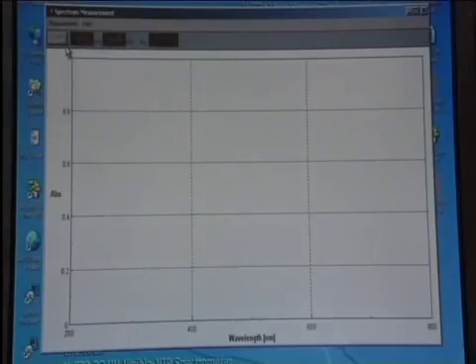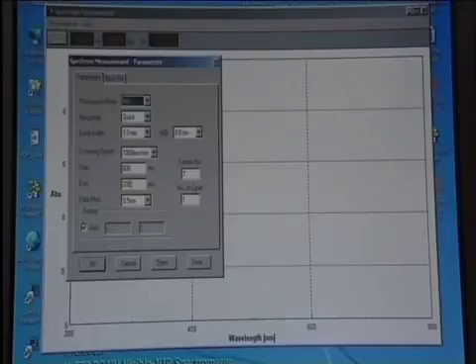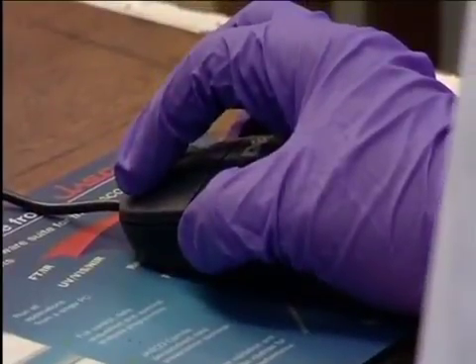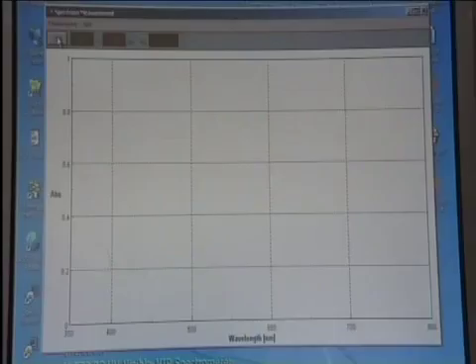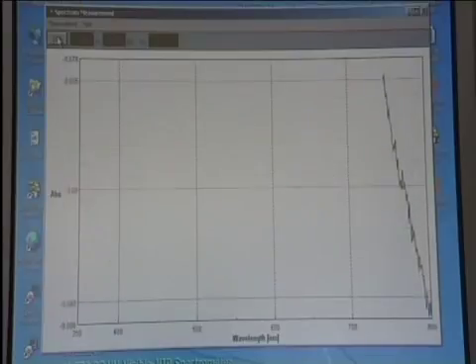The operator types details such as the wavelength range required and scanning speed into the computer that controls the instrument. He also zeros the instrument at a point where the sample does not absorb and then starts the scan.